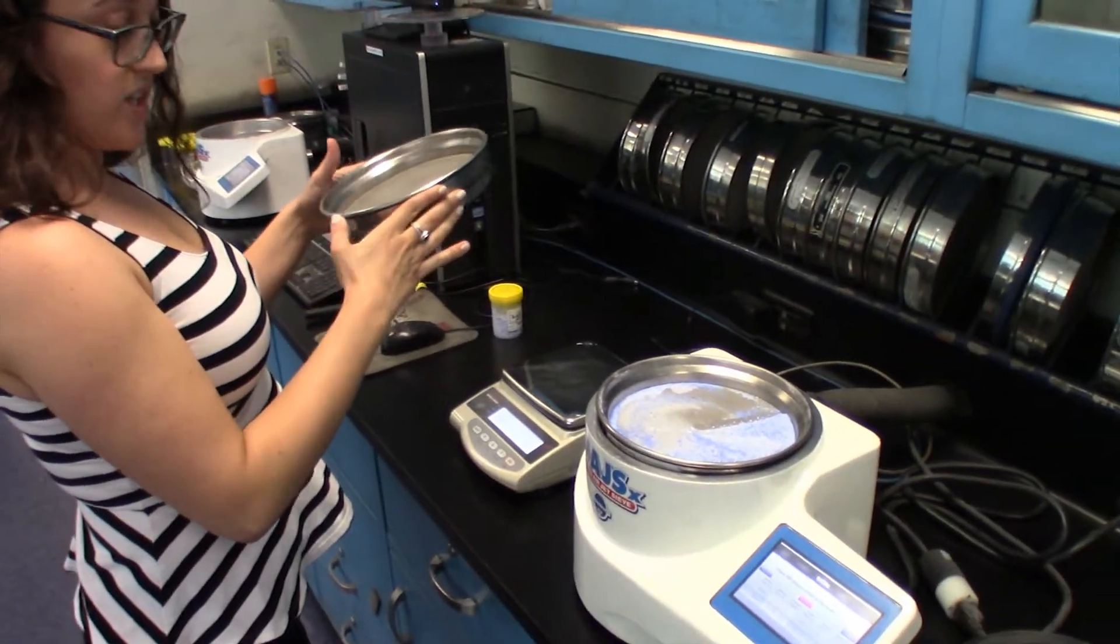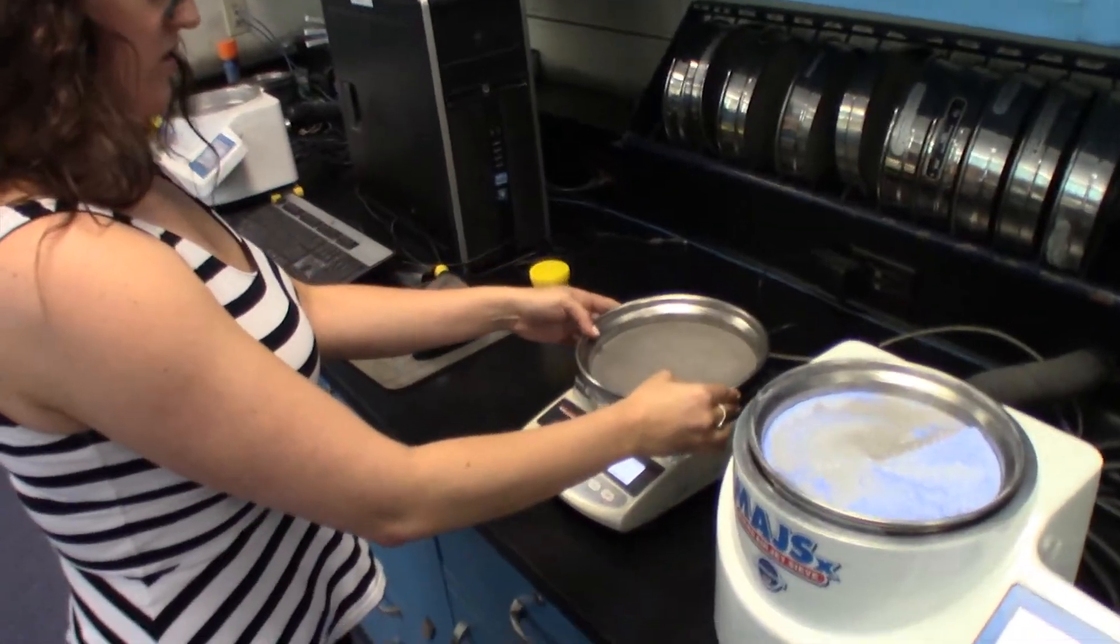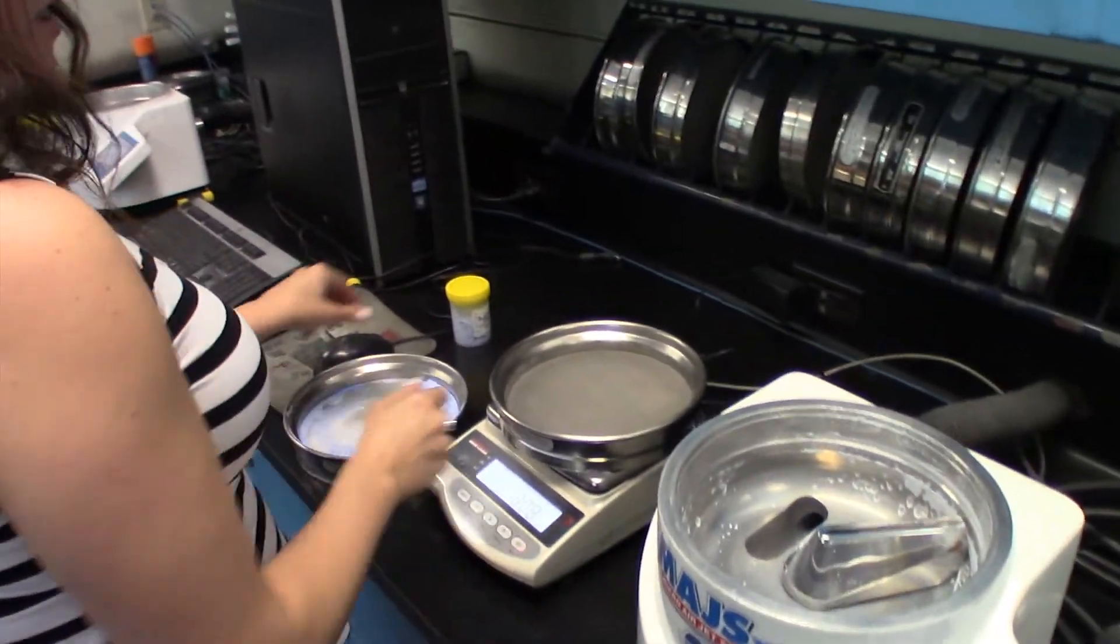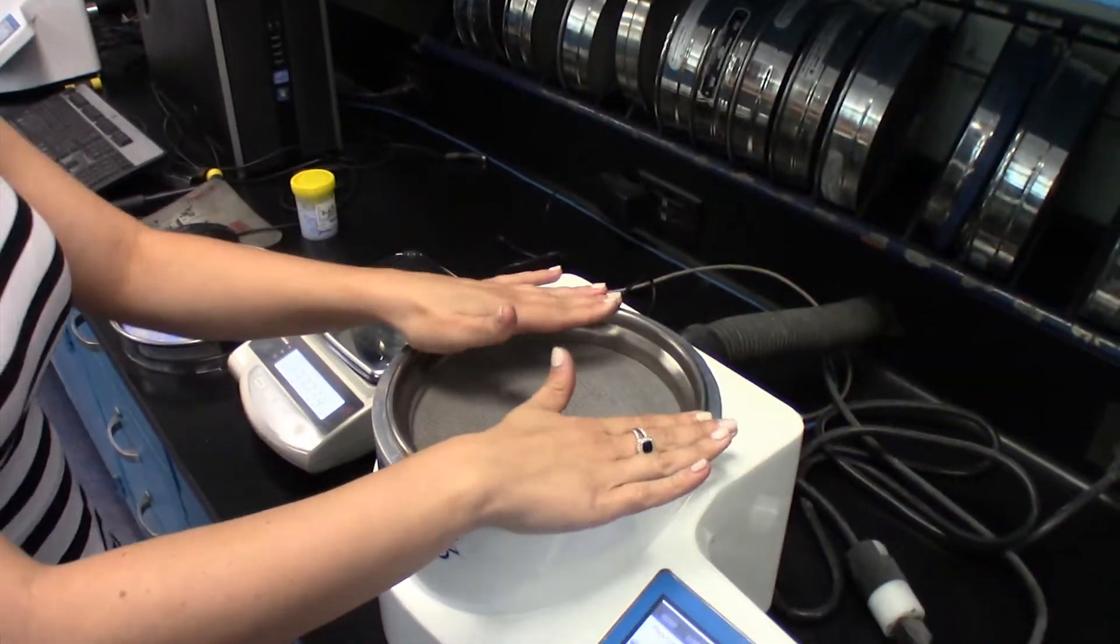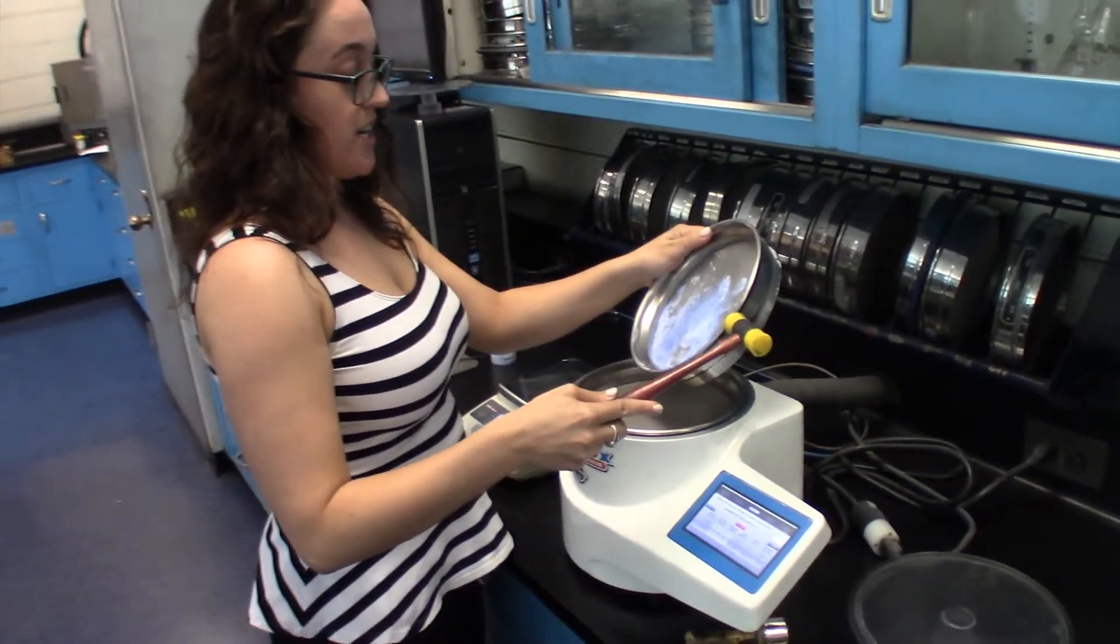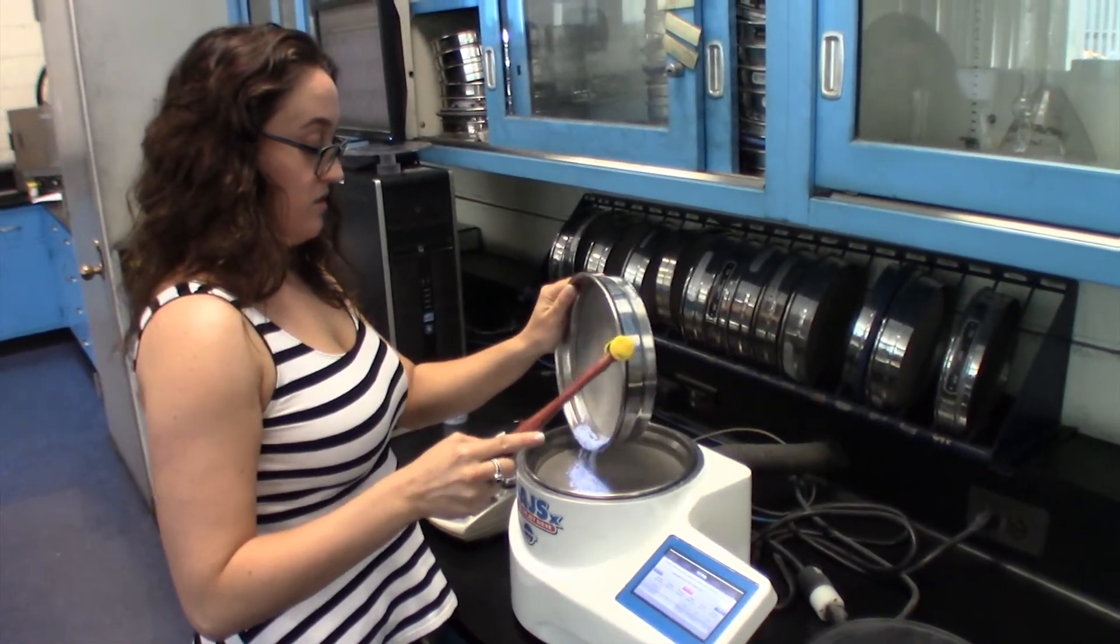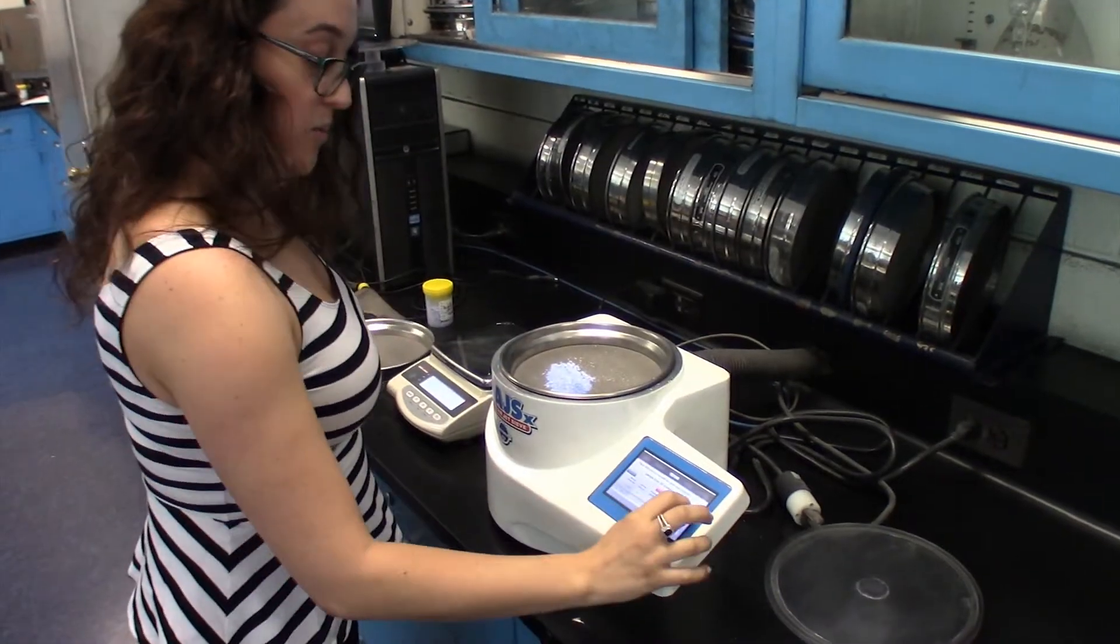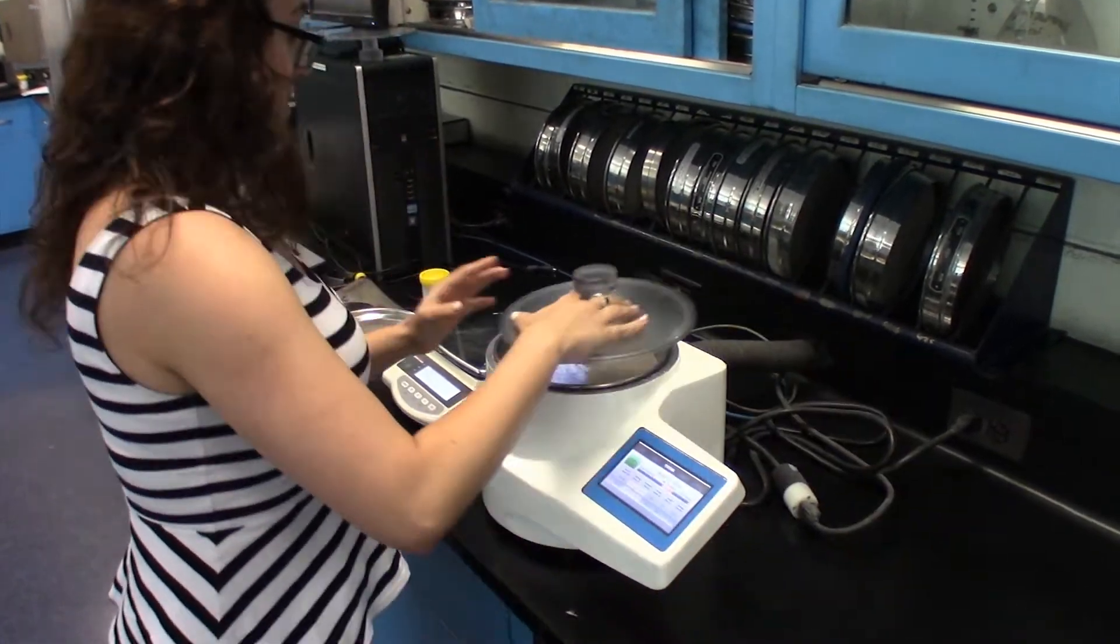We're going to weigh the next sieve screen, the 500 micron sieve screen. Press next. We'll place the 500 sieve screen on the sieve and we will transfer the retained sample. And we will press next and then start again.